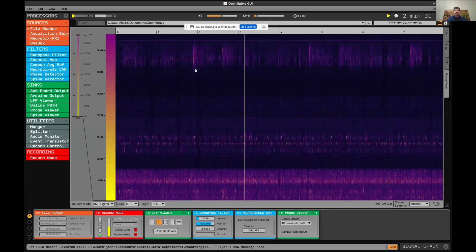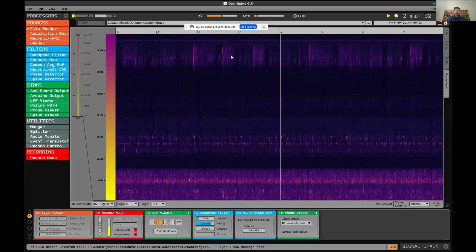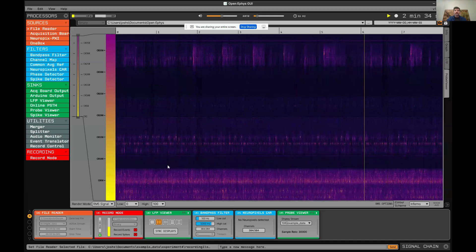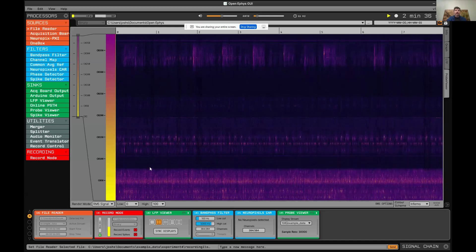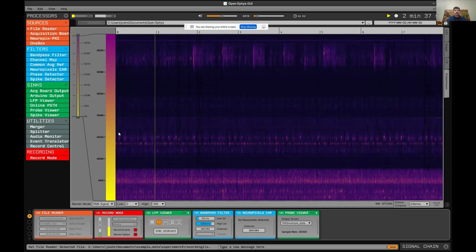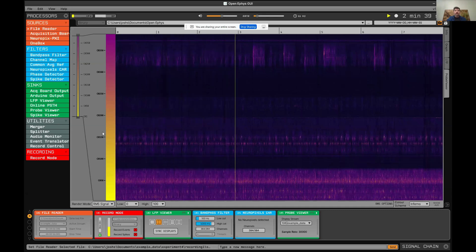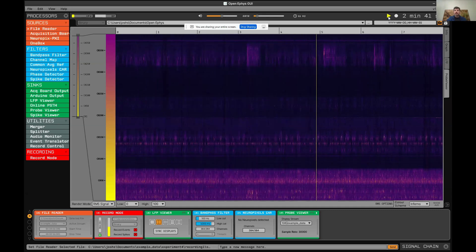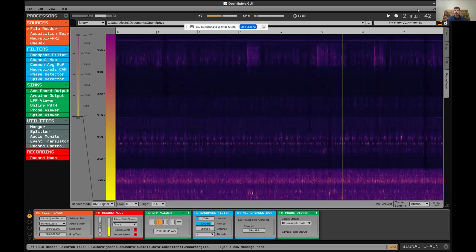In this example, it's a probe that's inserted through cortex, hippocampus and thalamus. This also integrates with Pinpoint so you can overlay the brain regions that you are recording from.